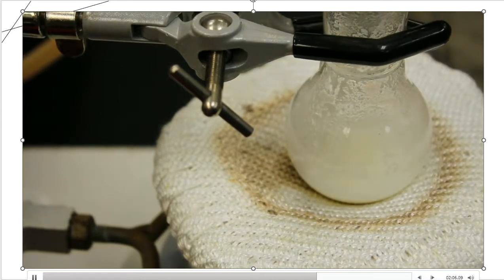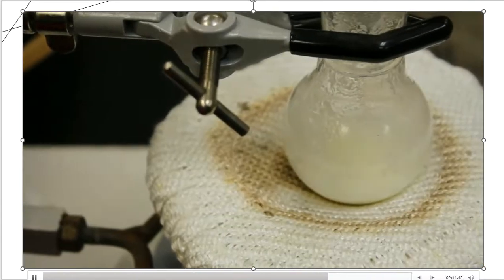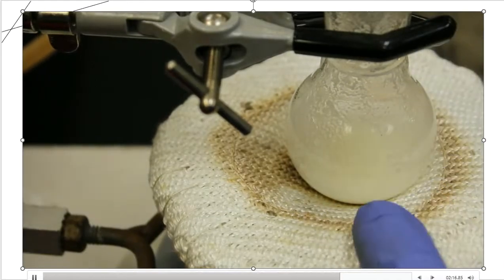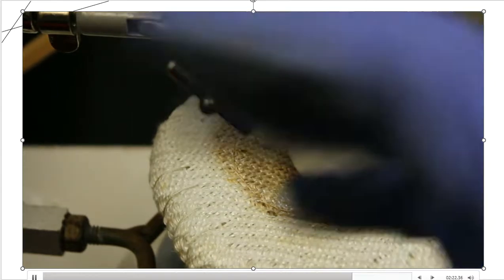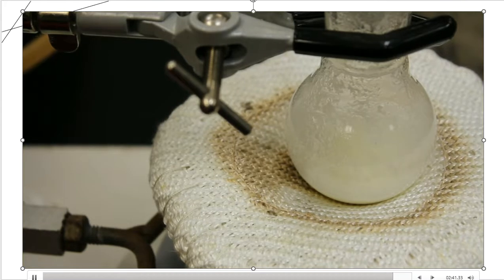Also, kind of strange, but you're seeing the drops that are happening here. It's like a drip, drip, drip, and you can see big drops that are happening. Every time it does that, it sounds like someone is in the lab beating a drum. It's very strange. Tiny little drops are hitting the boiling flask, and every time I hear a drum-like noise begin, I actually thought somebody was outside of the building beating on a drum in a parade. It's kind of weird, but that is an observational note that I can make, because that is somewhat out of the ordinary.